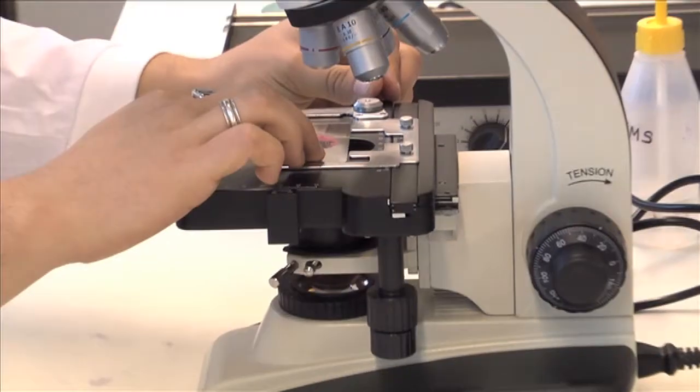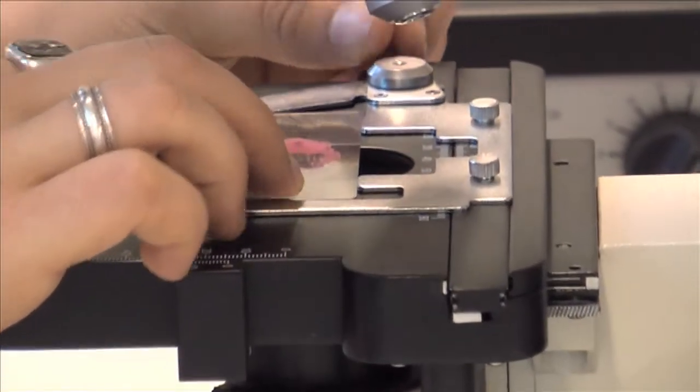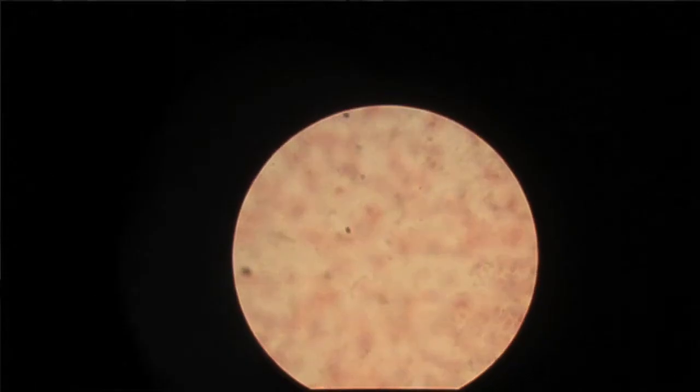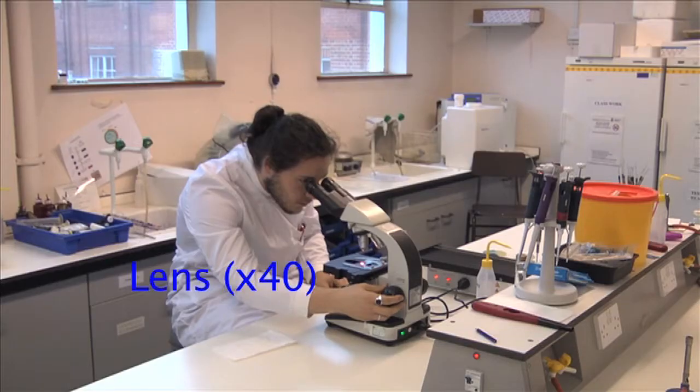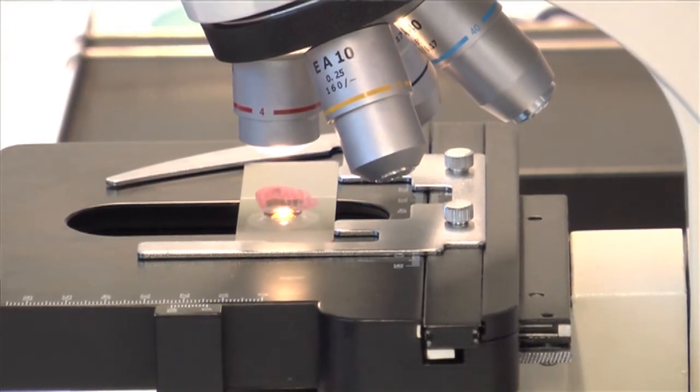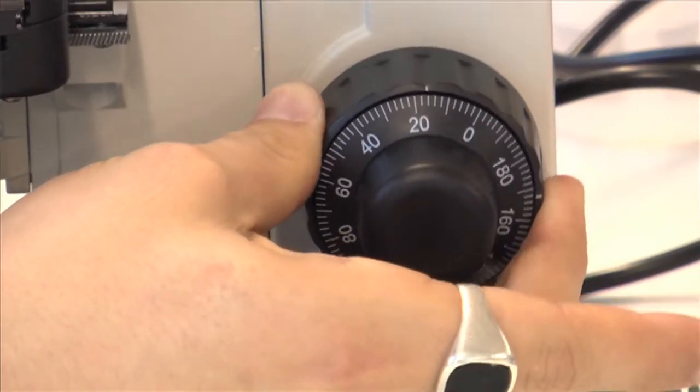Place the slide carefully onto the mounting stage. Be sure to start on the x40 magnification, or the red striped lens. Focus using the coarse focus — that's the outer ring — to get the sample into view. And then use the inner knob to fine focus and get a better picture.